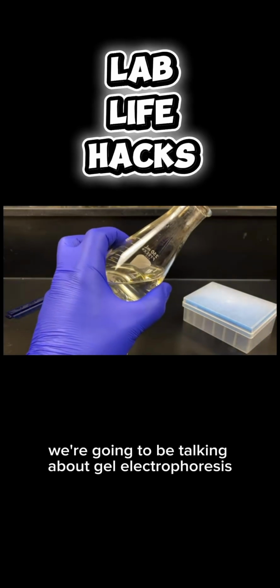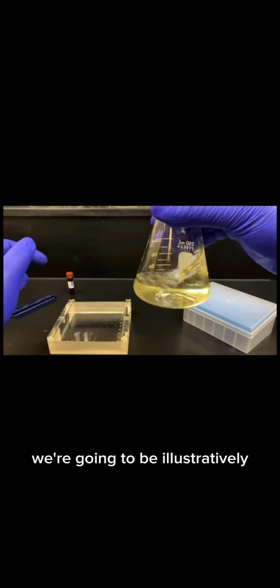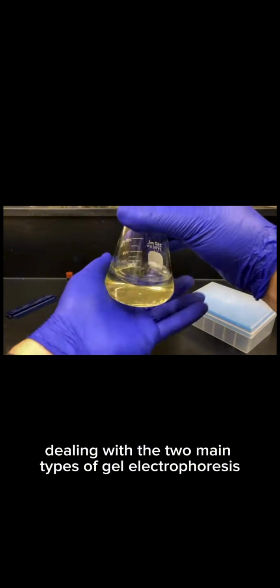Today on this channel we're going to be talking about gel electrophoresis. And in gel electrophoresis we're going to be illustratively dealing with the two main types of gel electrophoresis.